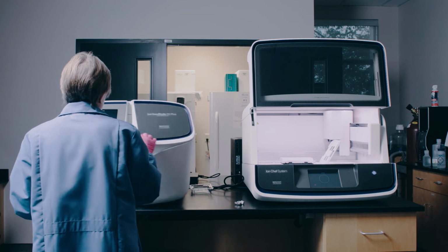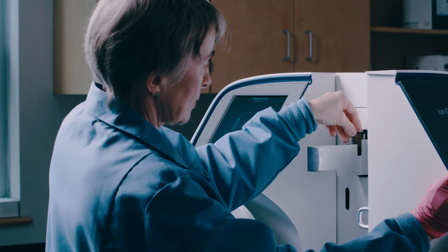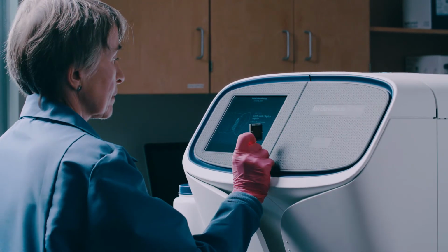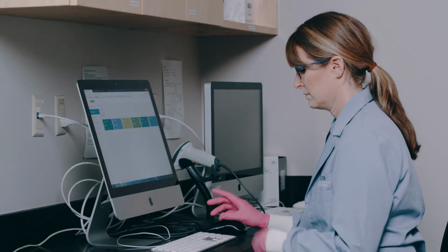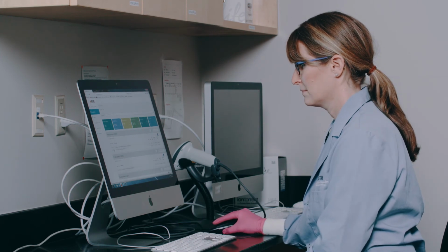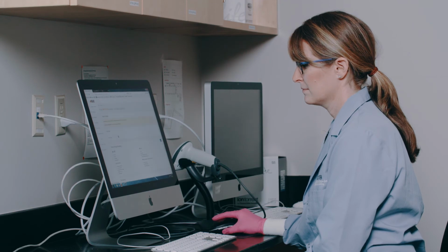The last step is sample sequencing. We'll move our chip from the Chef to the Ion GeneStudio S5 sequencer, a semiconductor-based NGS system. After the program runs, we'll be able to see data for each of our 96 samples. We'll upload them all to mBRAVE, an informatics platform specifically designed for metabarcoding data. Here, we'll see the analysis and identifications.